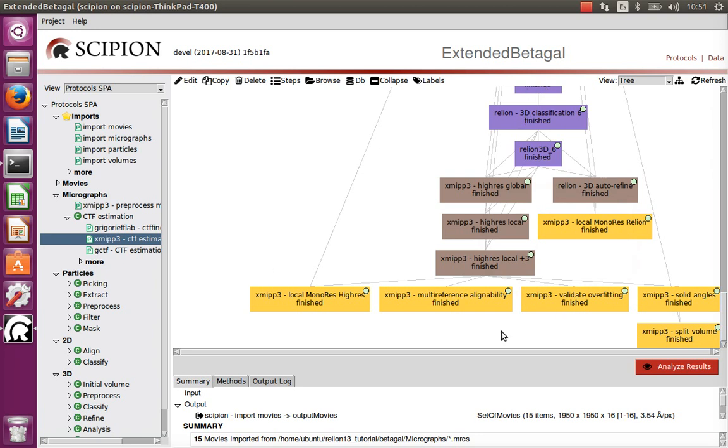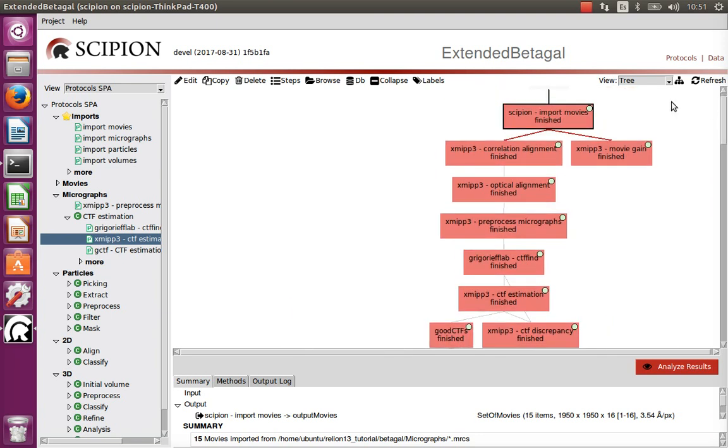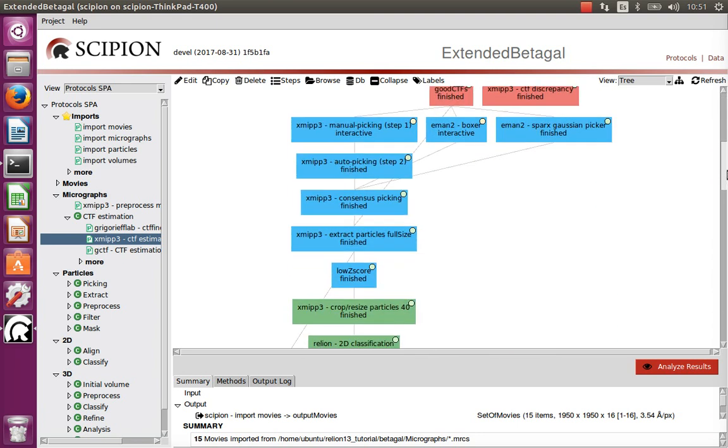And finally, we will validate our structure. So in this video tutorial, we will show only the first part, and the following parts will be recorded in separate videos.